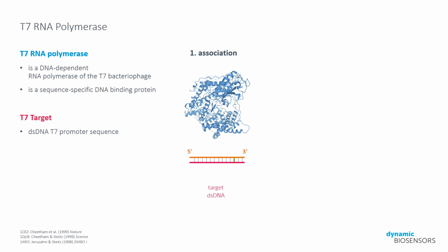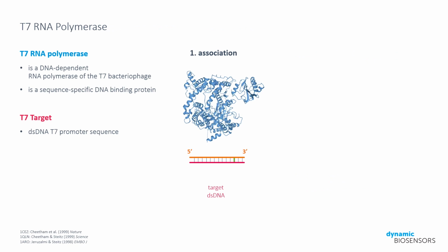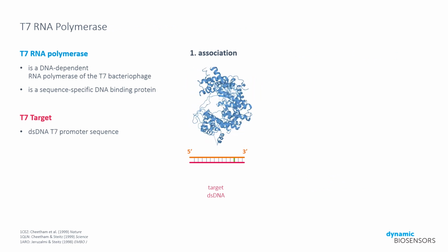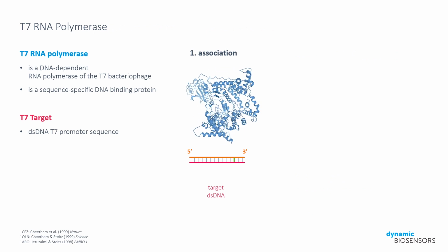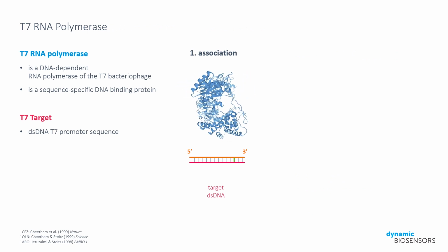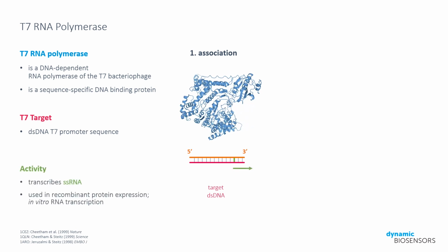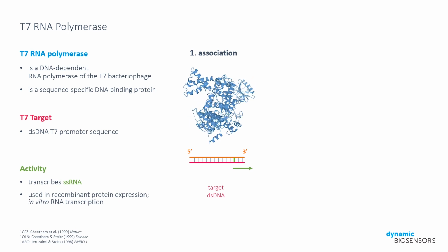Before we get into the technical assay setup, let's start with a basic understanding of the function of the T7 RNA polymerase. RNA polymerases bind to a specific DNA sequence, the promoter, as a first step in the transcription of DNA to RNA. The T7 promoter has been defined as a region that includes just 18 base pairs. The activity of the T7 RNA polymerase is to transcribe single-stranded RNA from the template DNA strand.